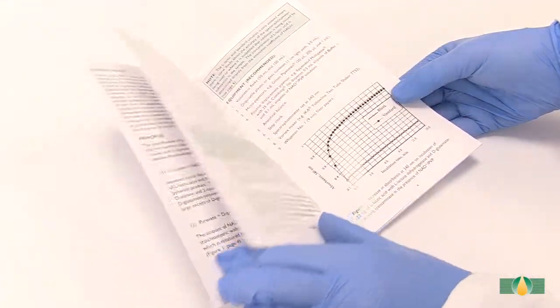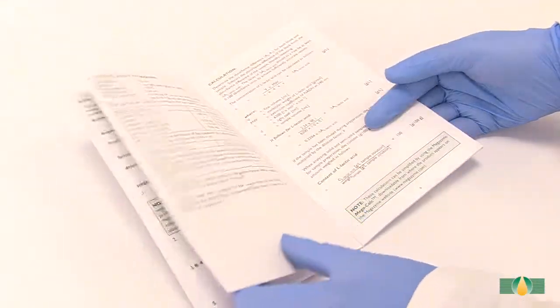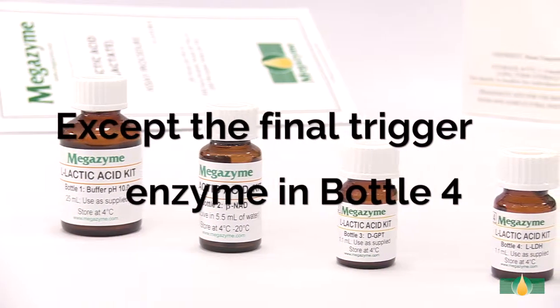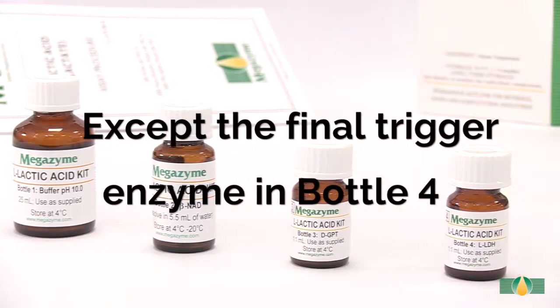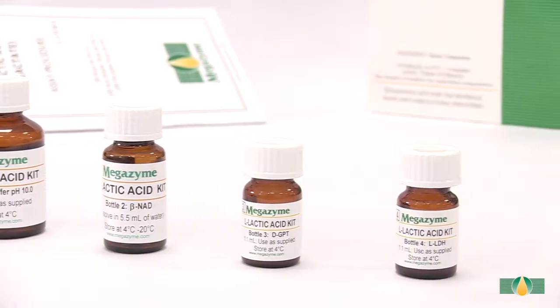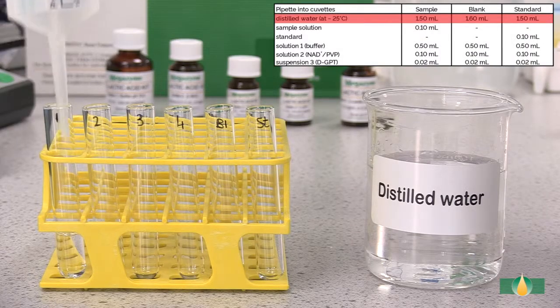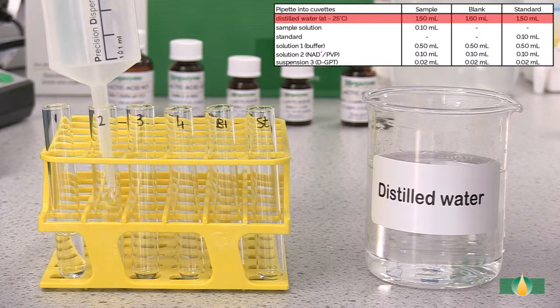Follow the manual assay procedure as described in the data booklet. Pipette all assay components except the final trigger enzyme in bottle four into each assay tube. A blank reaction and a standard reaction must be performed with each batch of samples. Pipette 1.5 milliliters of distilled water into all assay tubes.